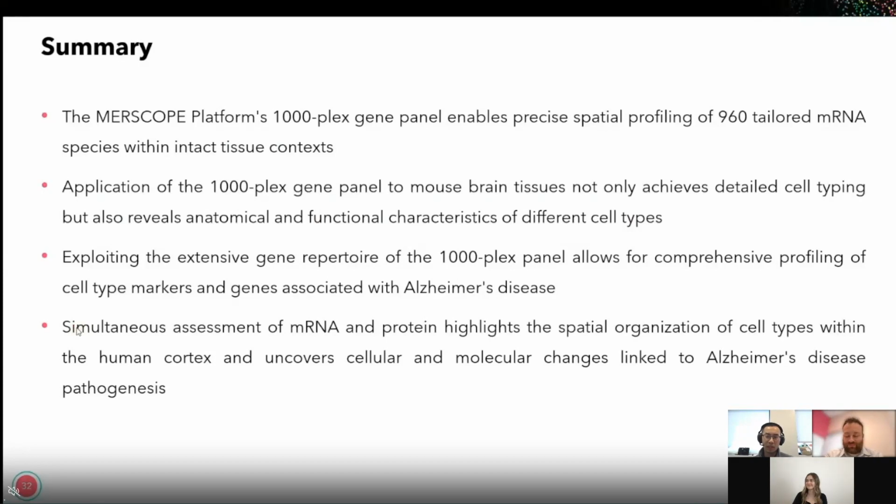So there are different ways to do cell type annotation. One way is basically to manually do the annotation. I still consider that's the most accurate. The strength of MERFISH or MERSCOPE is that you get both molecular information and spatial information. Combining these two, to me, it's quite simple to annotate those cell types.